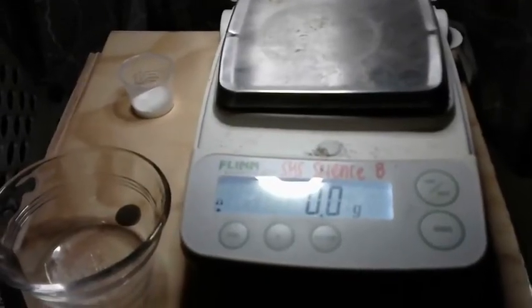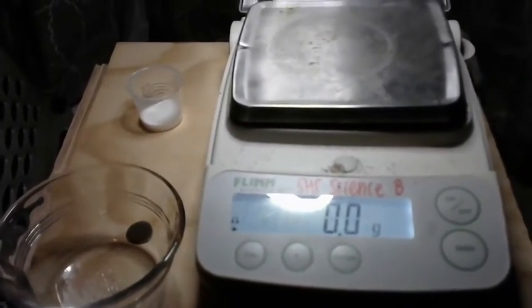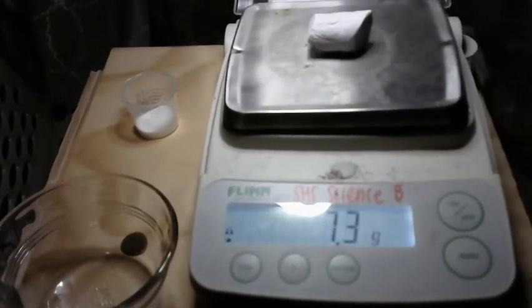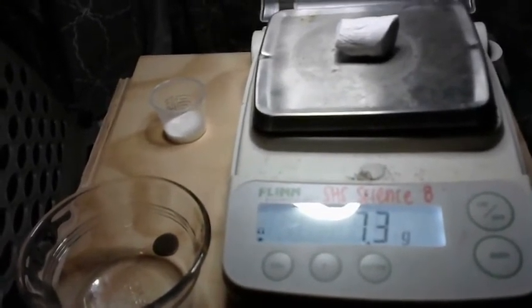So now I'm back after writing my name. And remember, I had my starting mass of calcium carbonate. So I'm going to figure out what my new mass is, after I've written my name. After writing my name, I am at 7.3 grams.